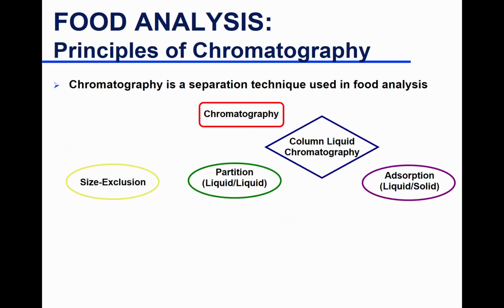Okay, so modes of separation. We're going to talk about planar. Planar means paper or thin layer chromatography, but most of the applications nowadays in food analysis is column chromatography. So there are a lot of examples that will be given on column chromatography.